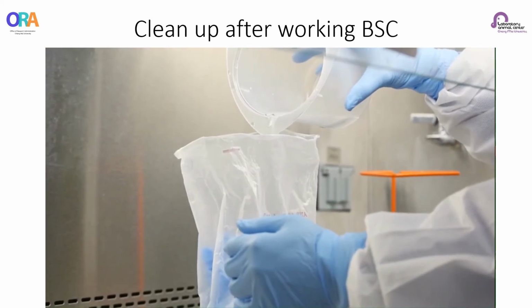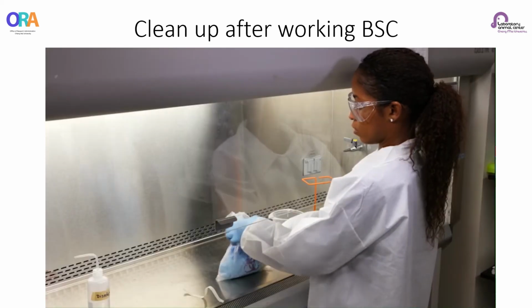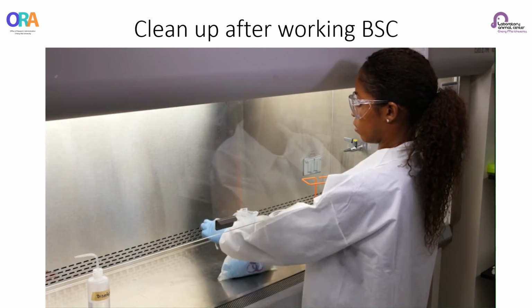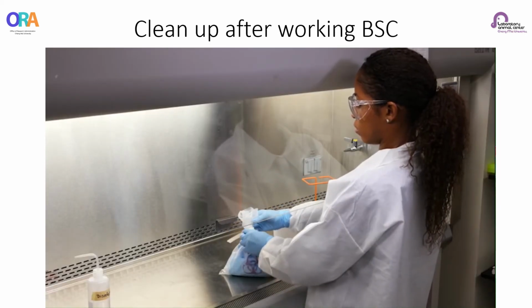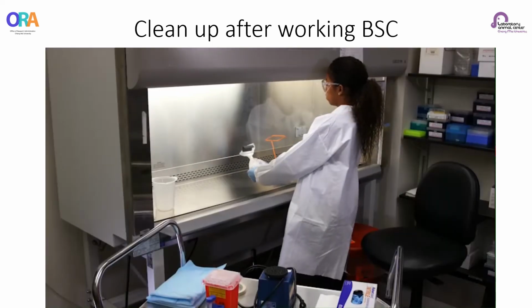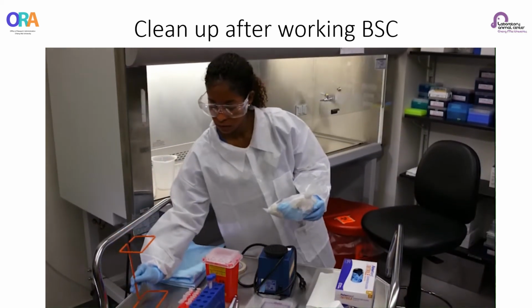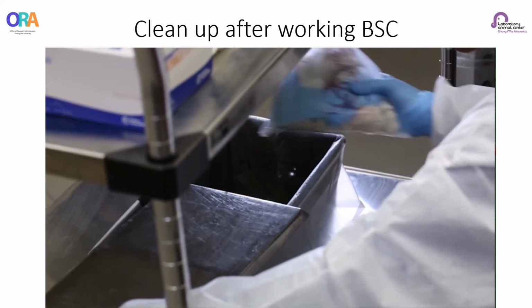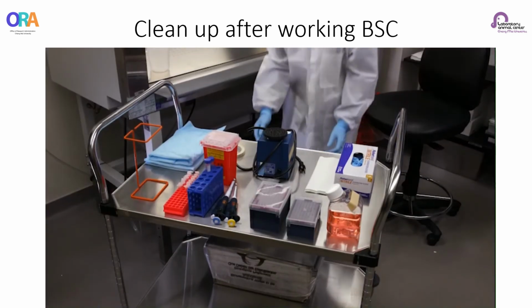Next, add the recommended amount of water to the biohazard bag, and then loosely gather the opening of the biohazard bag and loosely tape it. The reason you loosely closed it is because you don't want it completely sealed when it goes into the autoclave. If it is, then the steam will not be able to penetrate the bag, and the contents may not be decontaminated. If only a biohazard bag was used, remove the bag and place it into a waste pan outside of the BSC for autoclaving. If a bag and a waste pan were used, remove both from the BSC.